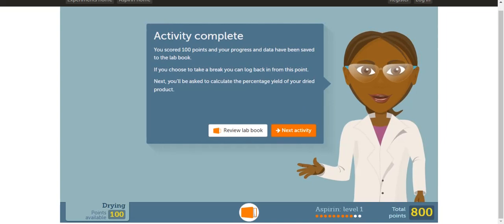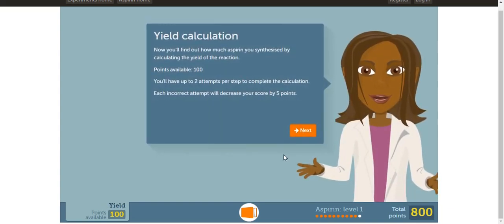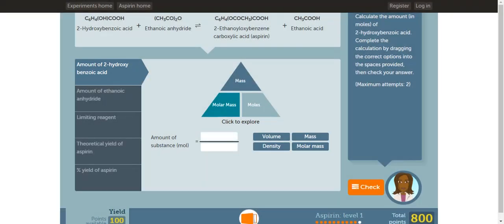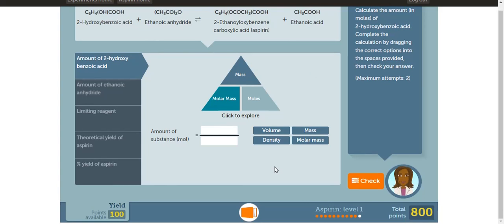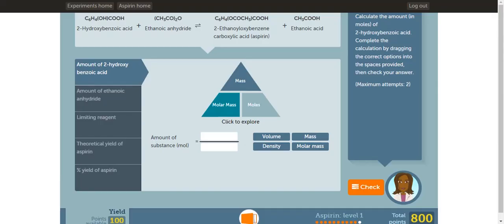In the next part of this virtual lab, you will be calculating the percent yield of the aspirin. Keep in mind, if you make a mistake, your score will go down by 5 points. In the first part of this activity, you'll be figuring out the amount of moles of the first reactant. To do that, you need to know the relationship between moles, mass, and molar mass. If you don't know the relationship, check the equation on table T. You can drag these boxes into the equation. Once you're done, click check.